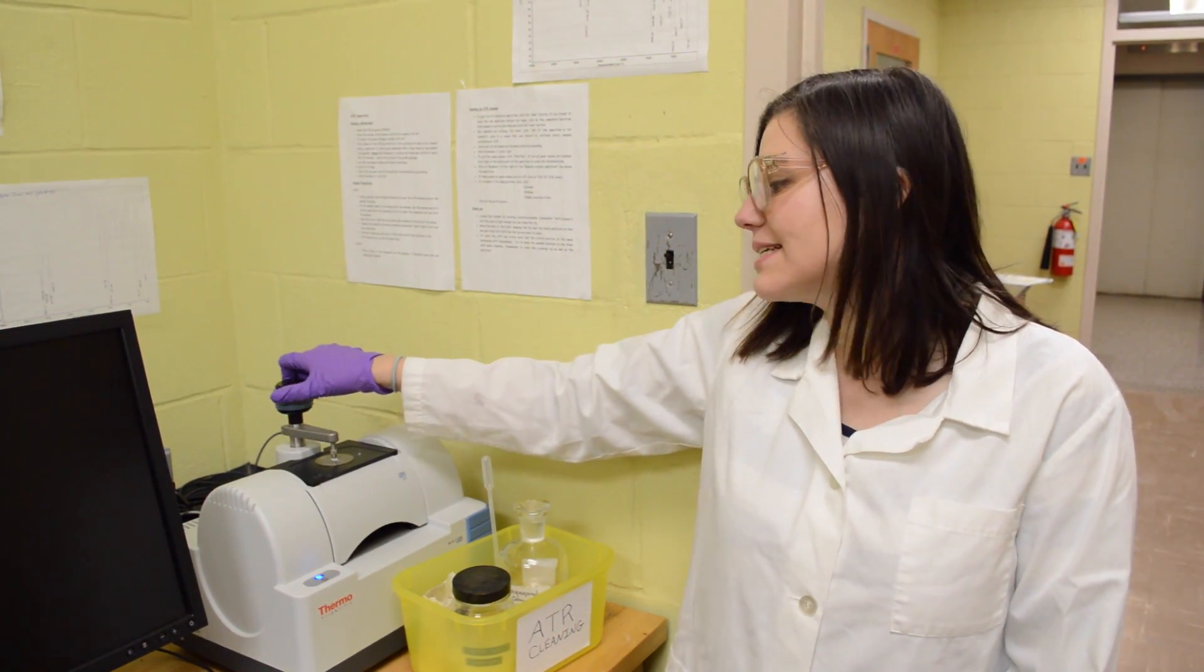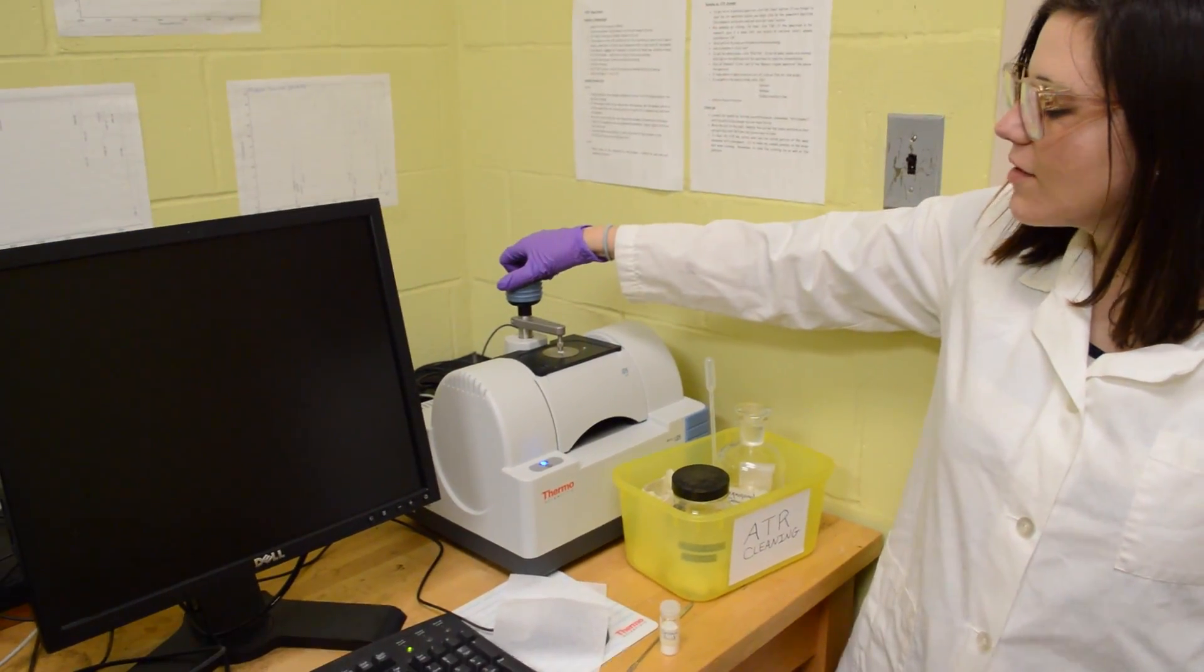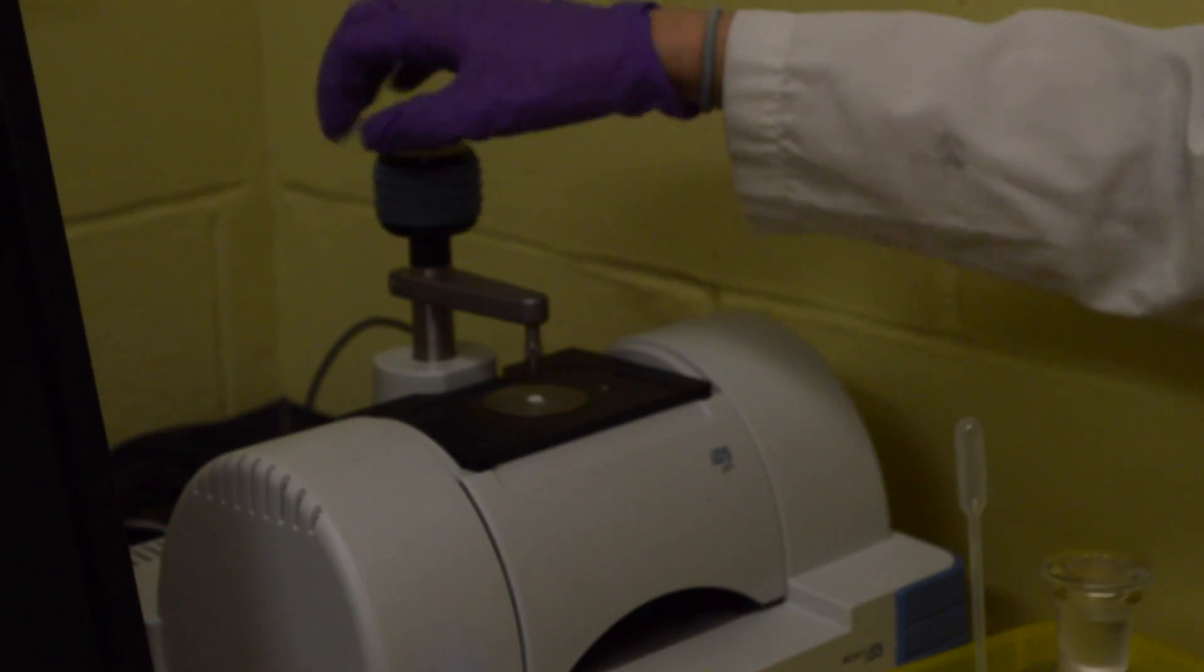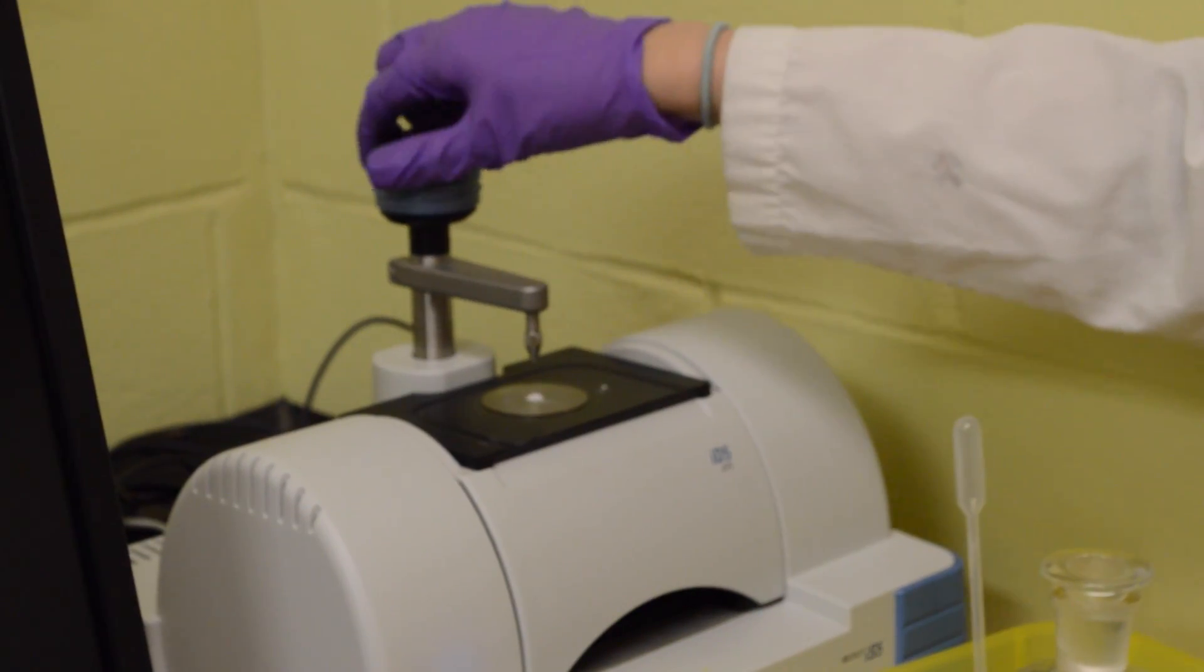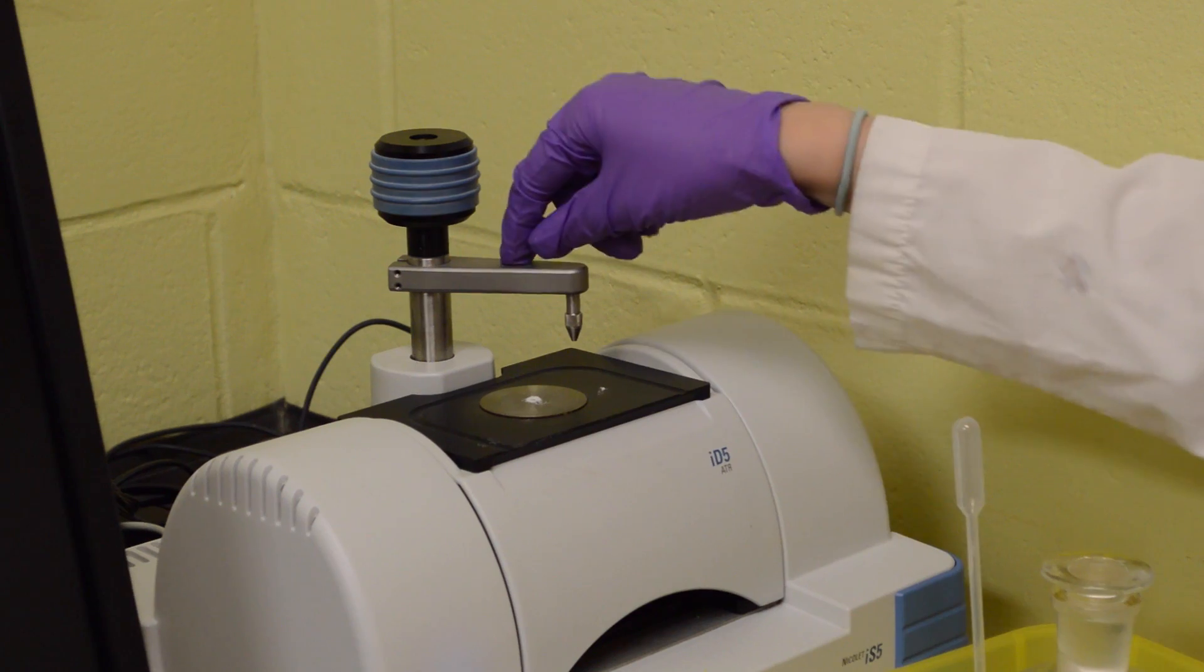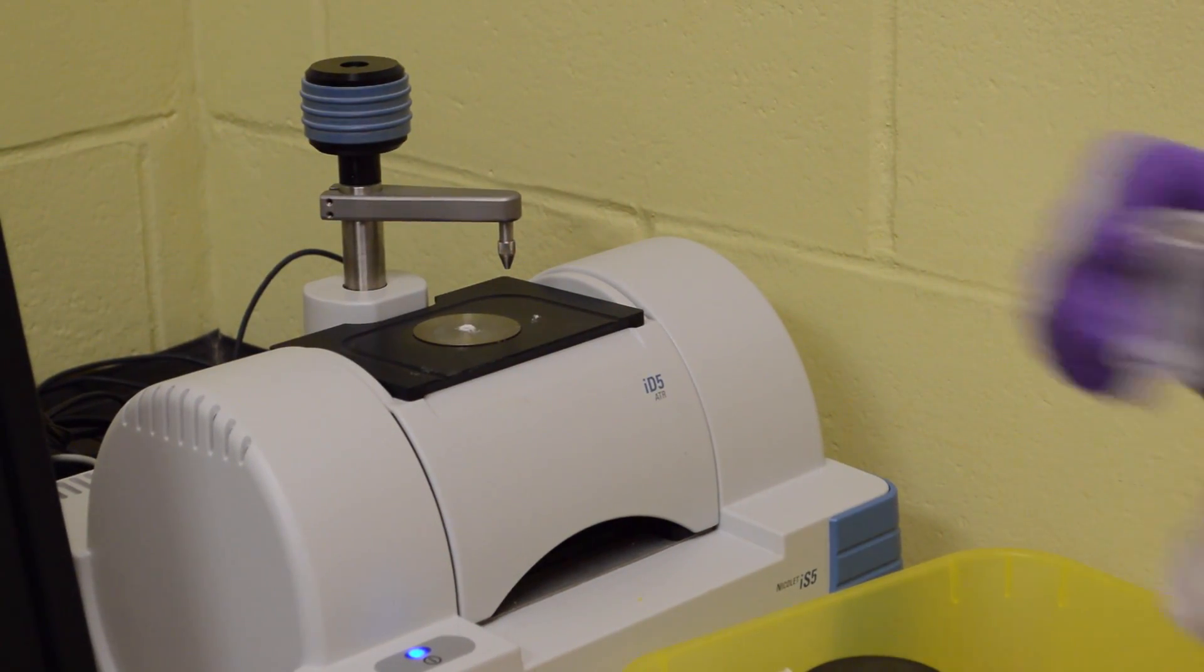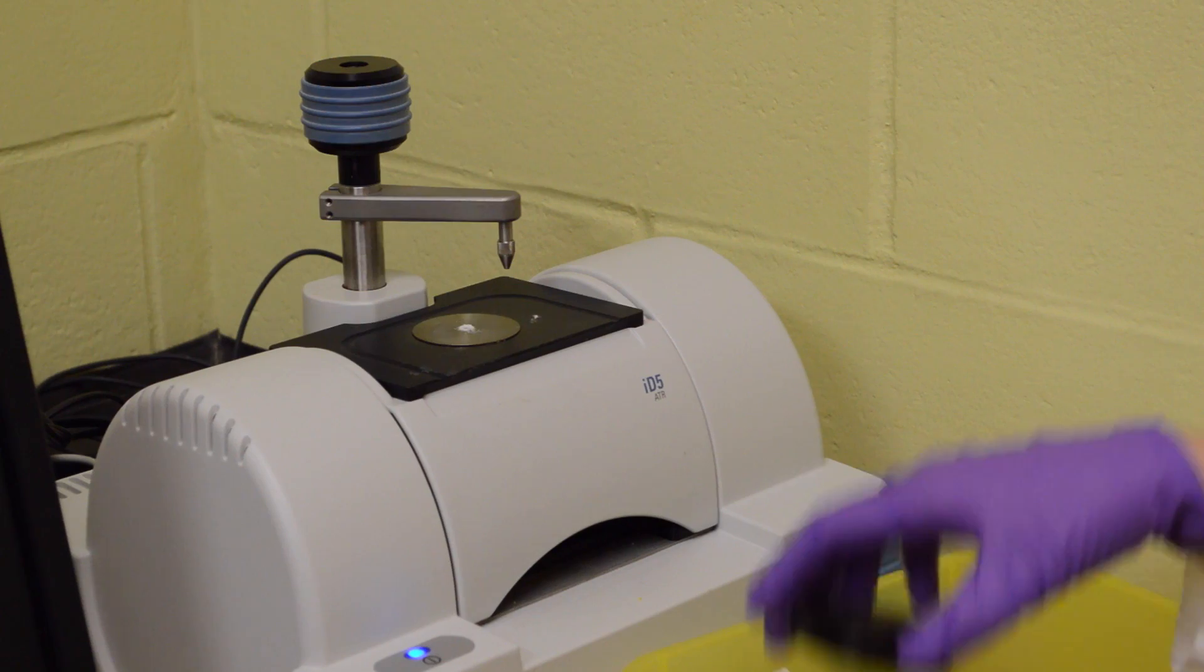Now to clean the ATR, we just want to go in reverse. We're going to turn this to the left until it's out of the way, and then move that handle over with our hands. We use isopropanol for cleaning the ATR. It's really great, it gets everything, lifts everything off.